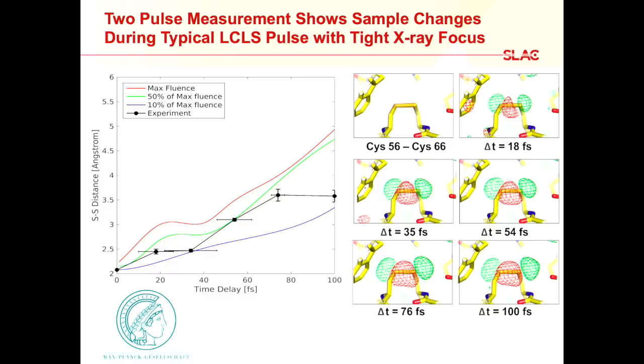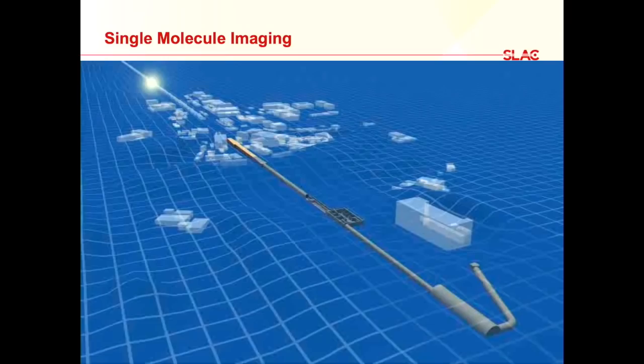And if you extrapolate this line and get a speed by taking this distance dividing by the time, you get roughly the speed of light. So sorry, the speed of sound. As I said earlier, the damage kind of happens at the speed of sound. So I like this pattern here because it reminded me of Mickey Mouse the first time we saw it.